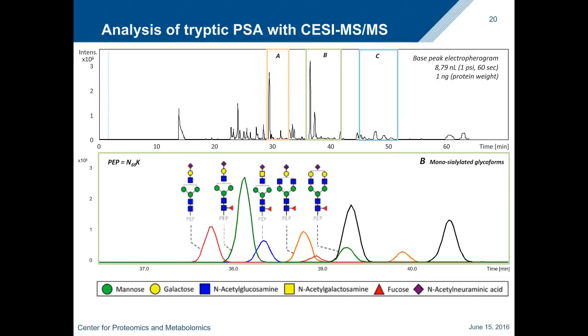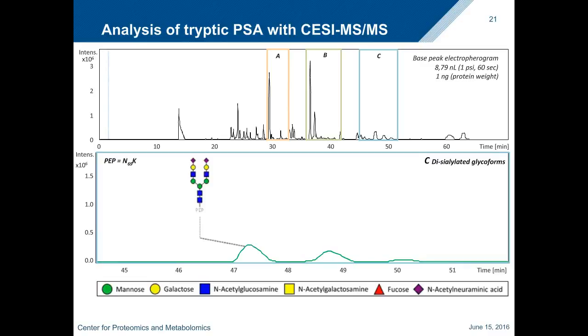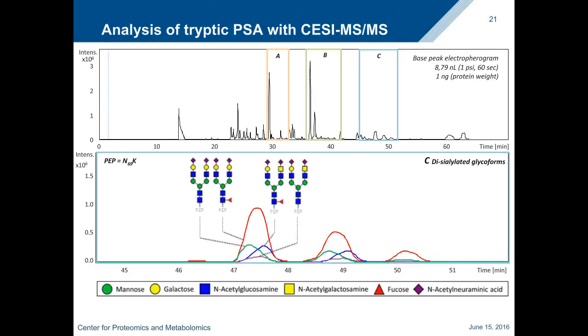So we thought, okay, let's have a look at cluster C. In cluster A, we only have the glycopeptides without a sialic acid. In cluster B, we have them with 1 sialic acid. And in cluster C, we observe the glycopeptides with 2 sialic acids attached. Here we observed even 3 peaks popping up at the same m/z value. Then we looked at this one, and again 2, and another one, again 2. Taking this all into account, we started wondering what is going on.